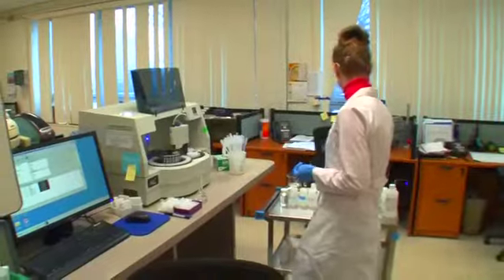So back to the non-scientist. That would be me. You put the chlorine in the water to clean it, and then the process of that mixing with organic material? With organic material that is naturally present in the water. Leaves and things like that. Correct. So we remove what we can, but there is a portion of the organics that can't be removed. And when the chlorine combines with those organics, you get what's known as a disinfection byproduct. Okay. One of those is trihalomethane.